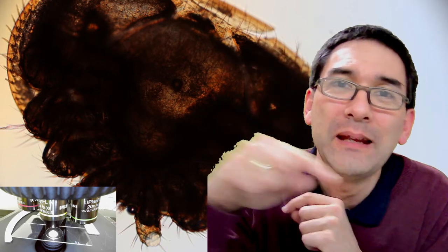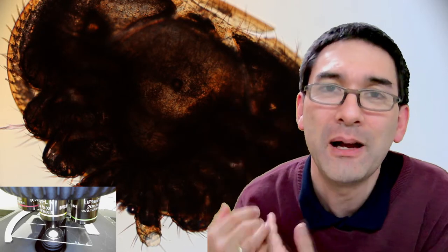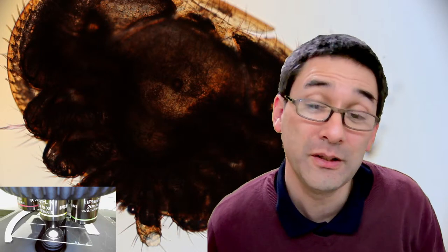No, it was a little bit, I found it a little bit funny. The labeling of the micrometer was inverted in my view, but it didn't impact the usability of the microscope at all. Okay, so this is the thing. There is nothing wrong with a bit of theory. Yeah, honestly, I don't know.